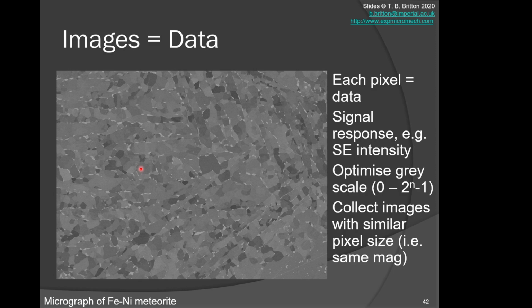It has 3 channels, red, green, and blue, each of which has 8 bits, so they can count from 0 to 2 to the 8 minus 1 in each of those colors. For a grayscale image, therefore, we're counting a range of gray levels, 0 to 255. So from a representation standpoint, that's useful to know.